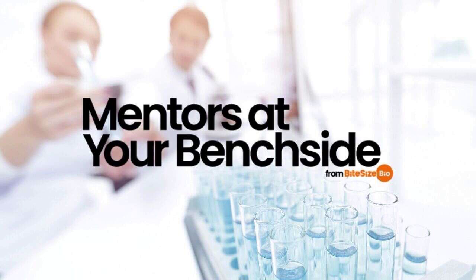When performing plasmid preps, getting good plasmid yields is vital. So what is a good yield? How do you optimize your prep to get a good yield? And what is it that causes low yields? We cover these questions and more.